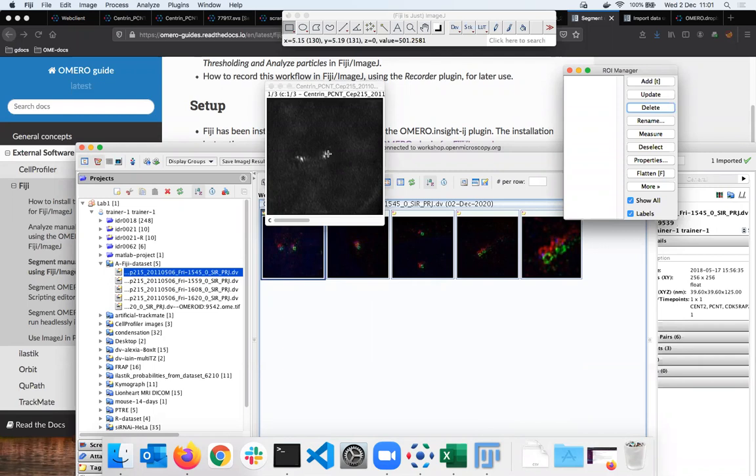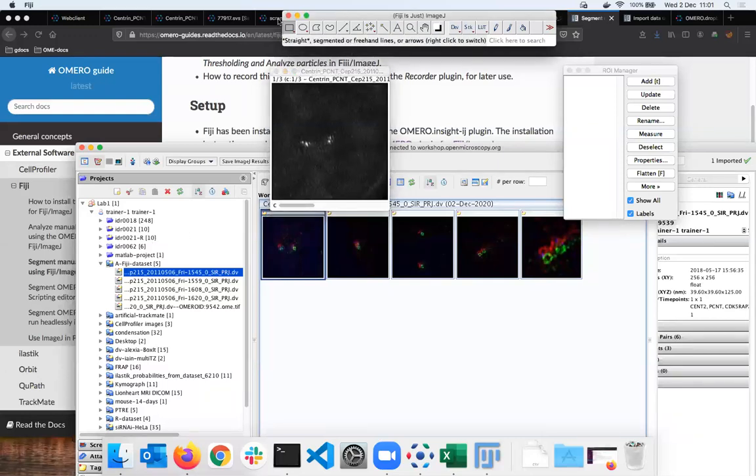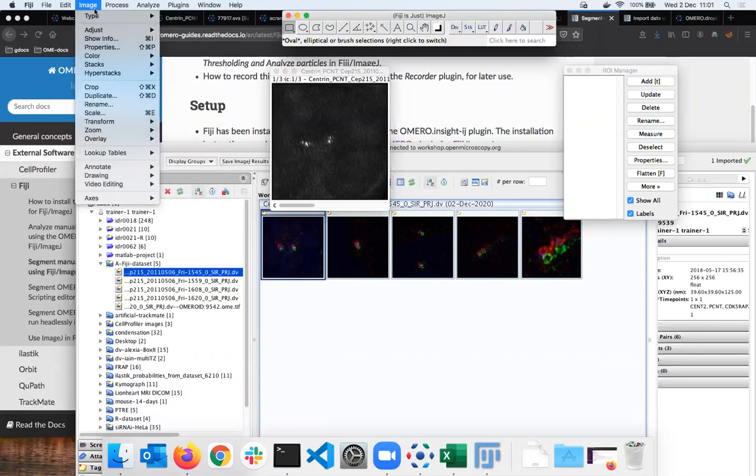segment and measure the resulting regions of interest, their diameter from Fiji. Okay, so this is my goal with this batch of images. I have 4 of them here in this data set, but they are coming from a bigger bunch of images coming ultimately from the image data resource IDR, where there are 414 of them, and they are connected to a scientific publication. Very good. I can go now and say, type 8-bit, okay.